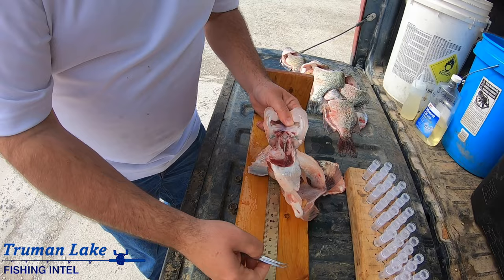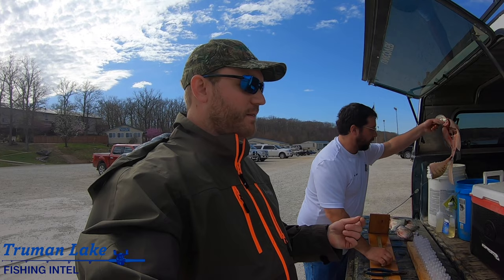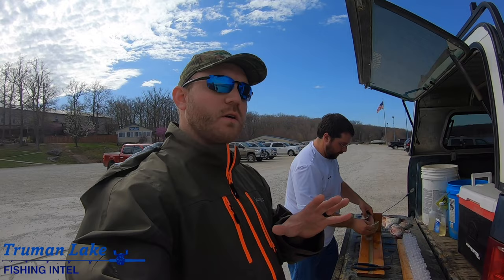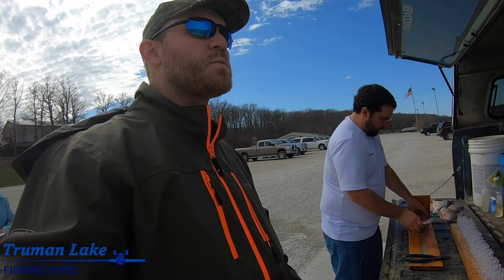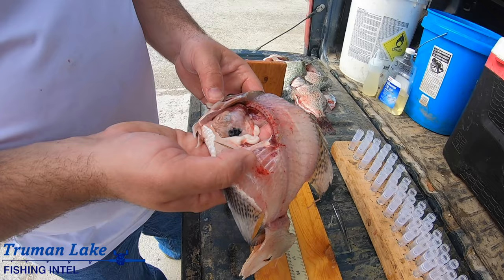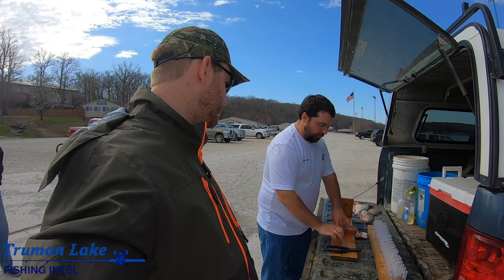Number 26. Now these otoliths, it looks like a flat, tiny flat clam almost. They've got rings on them like a tree, and so they will count the rings and you get the approximate number of years. Ten point three inches - you can see that it's a male, that's what that part right there is.